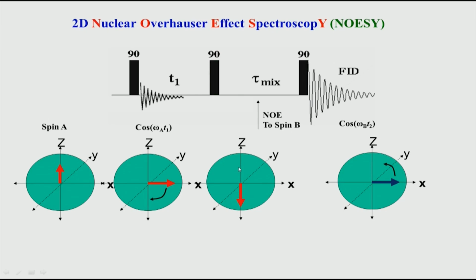So, during that period, during the T1 relaxation, we give a delay that is known as a mixing time. Okay. So, this is typically a long delay, depending again on the size of the molecule and so on. So, let us say we give a delay of the order of tens of milliseconds to hundreds of milliseconds. Typically for proteins a value of 50 to 100 milliseconds is used. For peptides and small molecules, we can go up to 300 to 500 milliseconds.